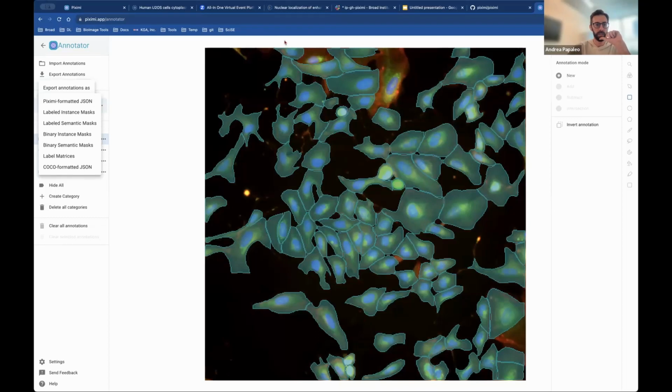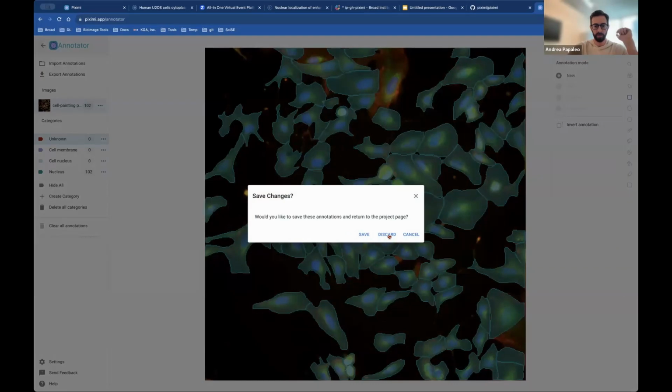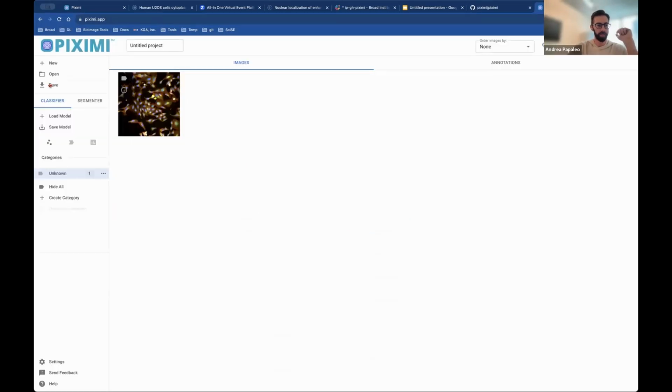Yeah, so we can do classification. So real fast, it's going to work on n channels. So if it loads quick enough, right, example project. So for example, you have this MNIST, right? It's just grayscale.